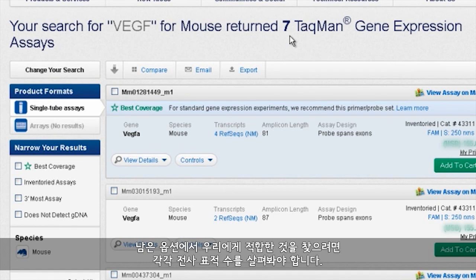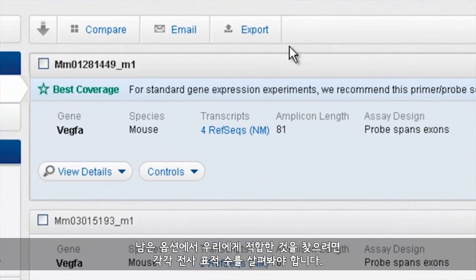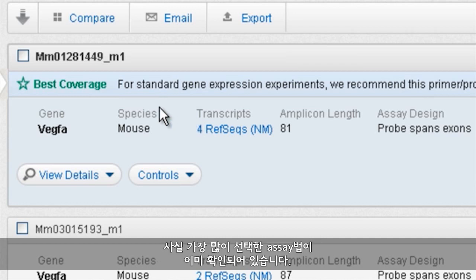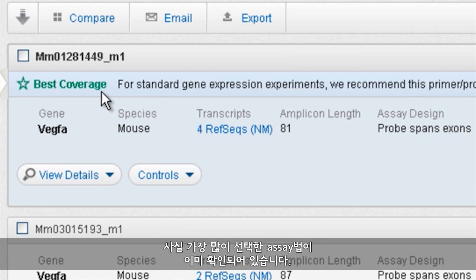To figure out which of the remaining options is right for us, the first thing we might want to consider is the number of transcripts targeted by each. We can find this information for NCBI RefSeq transcripts under the transcripts heading. The assay that picks up the highest number is already identified for us — it's the top one that hits four different known transcripts.